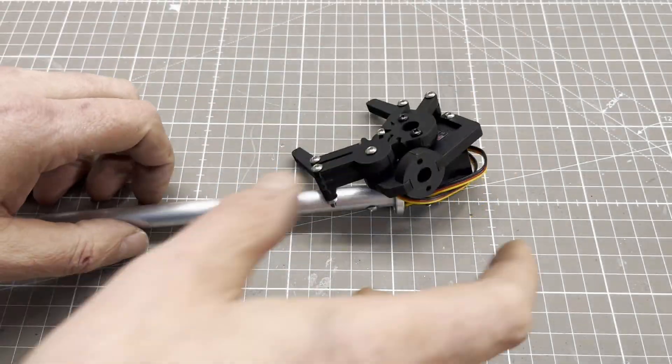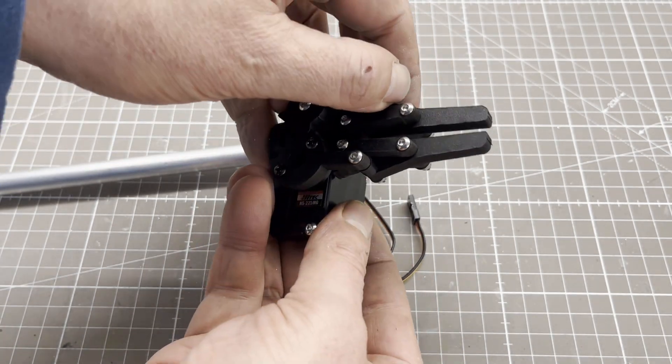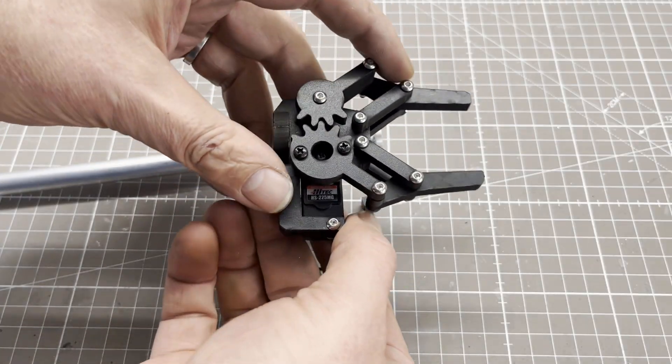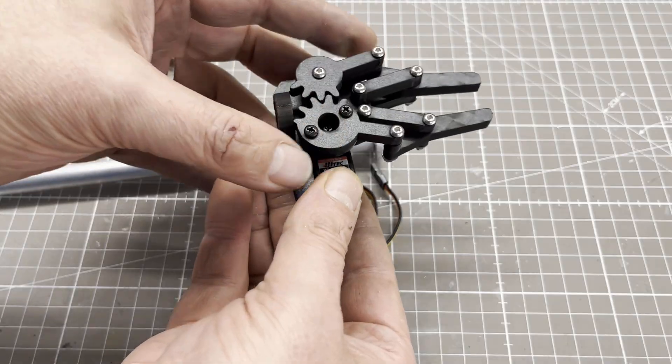You may be wondering what the robot gripper is for. I thought I could use it to manipulate the sample vials. To prevent it from interfering with the actual sampling process, it needs to be designed to be extendable.